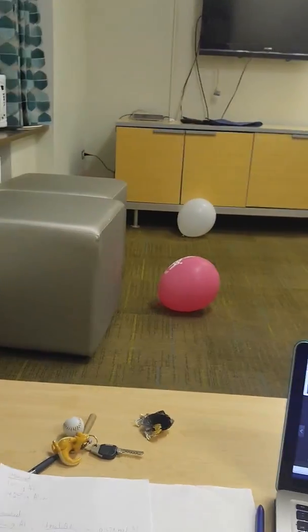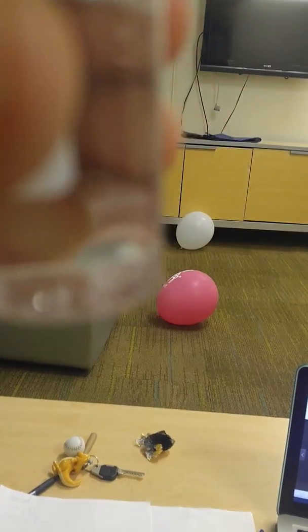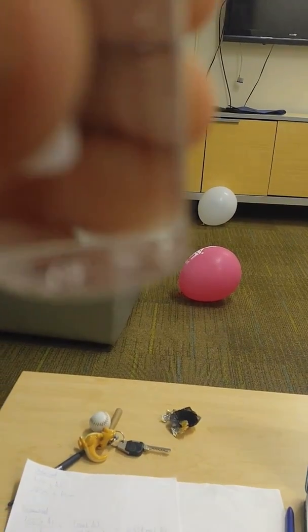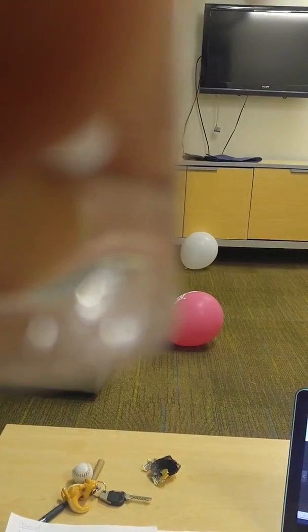So what's happening here is there's a nucleation site at the corner right here. Once one crystal is grown and set in that nucleation site, it makes it easier for the rest to follow in that crystal structure, allowing them to grow to bigger sizes much quicker.